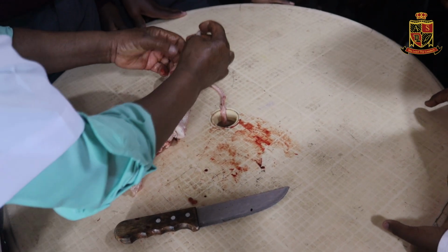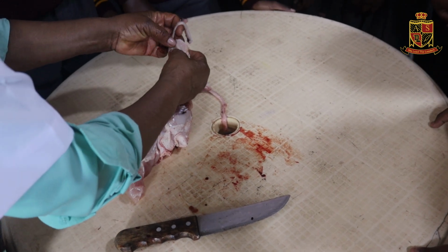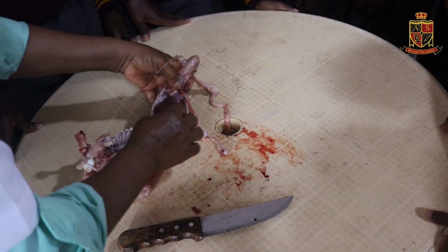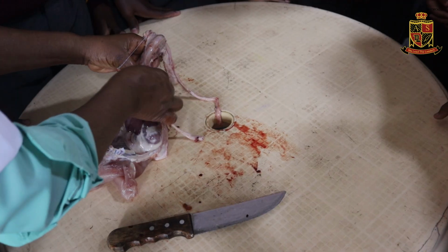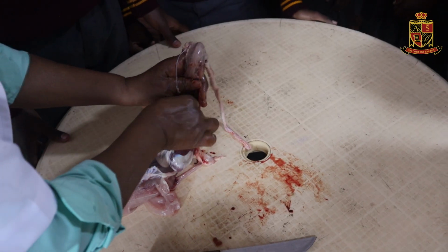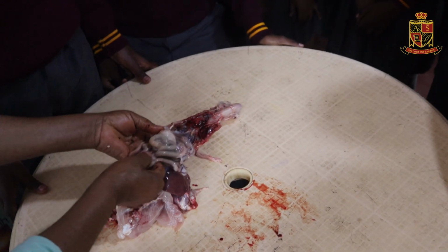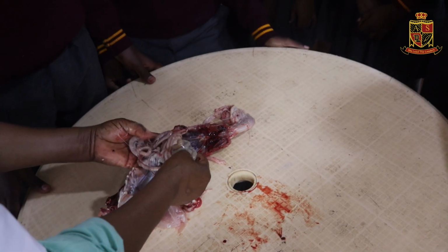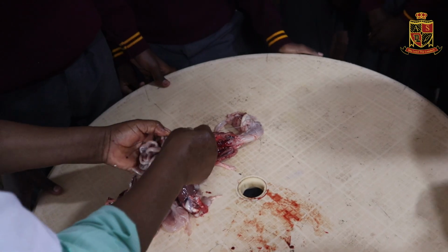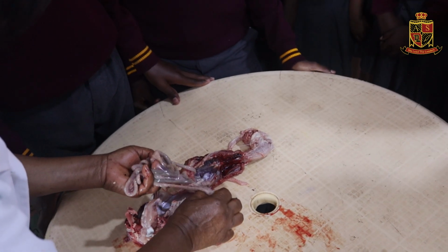And the food will be stored in this one. Yes, this is the stomach where the food will be stored. I only wanted you to see this inside part of the chicken. This is the liver, okay? Are you seeing it? Yes. These are the intestines of the chicken. The same applies to our own intestines, okay? But I only wanted you to see the position.